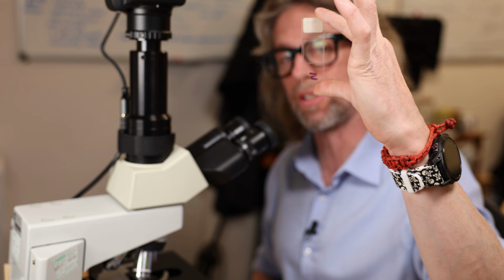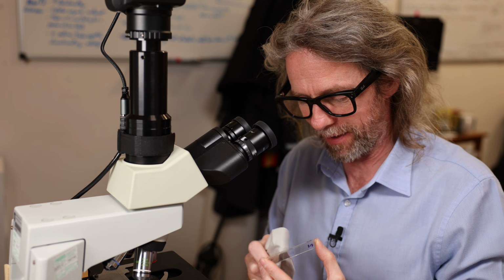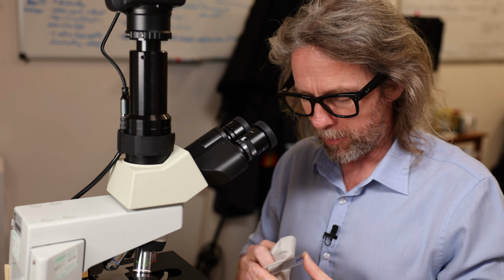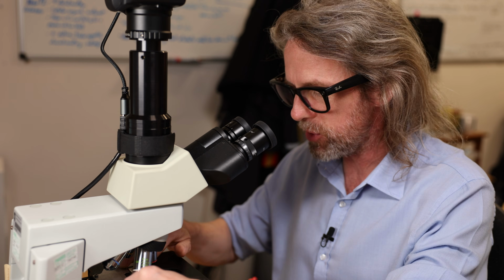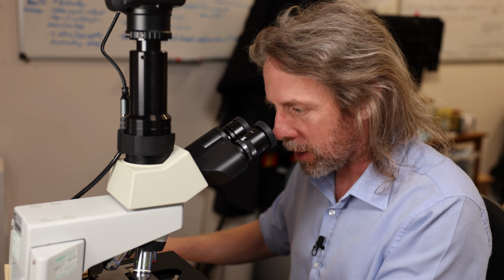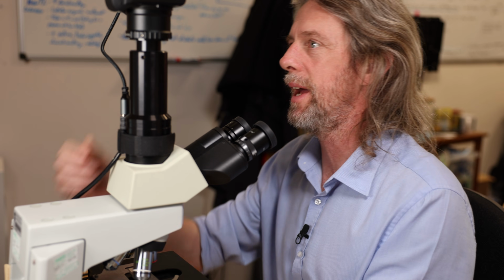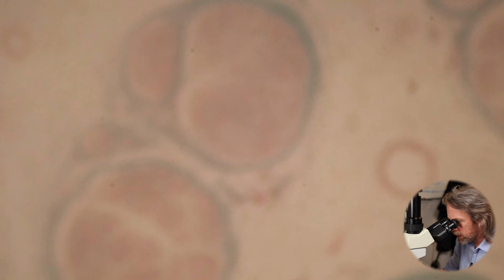If you cut a cross section through it, you could still fit it onto a slide like this. But nerves are interesting because they're made up of really, really big cells, right? I mean, some neurons can be in us a meter long. So in really big animals, imagine how big they can be, right? Okay, so this is the lowest power I've got.